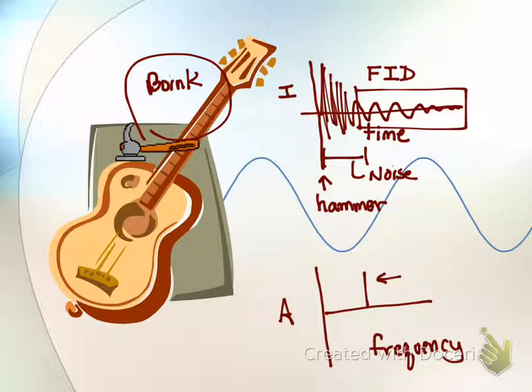And then if you wait just about 3 or 4 seconds, now you don't get to hear this, but it could be converted to an audible signal. If you wait 3 or 4 seconds, then what happens is the noise goes away and all the resonant frequencies persist. And they start off high and they go down low and they produce this thing that looks like what I called an FID. This is known as a free induction decay. Okay?